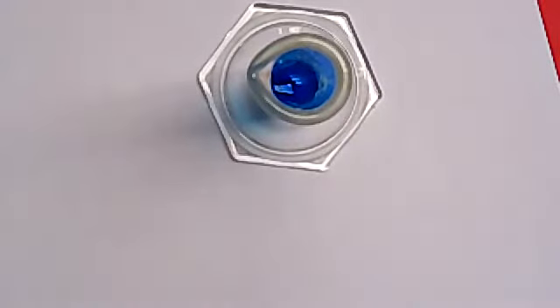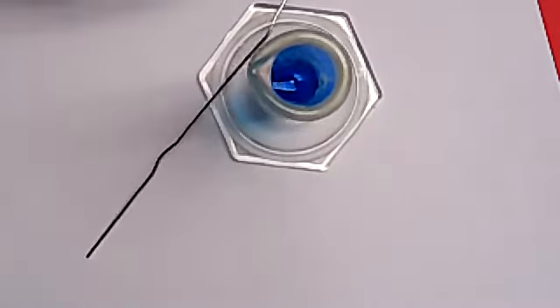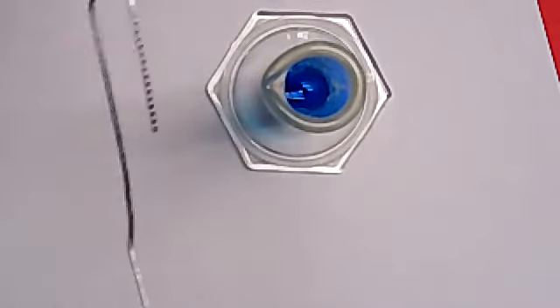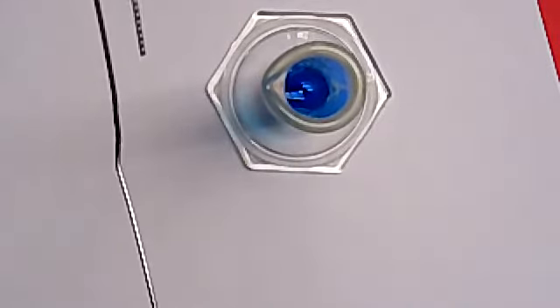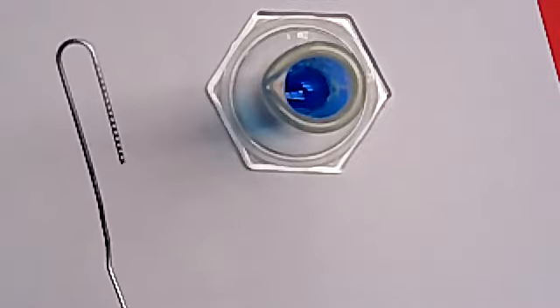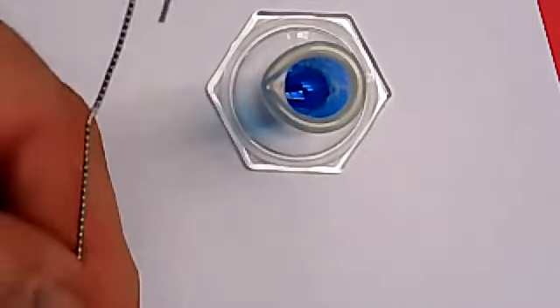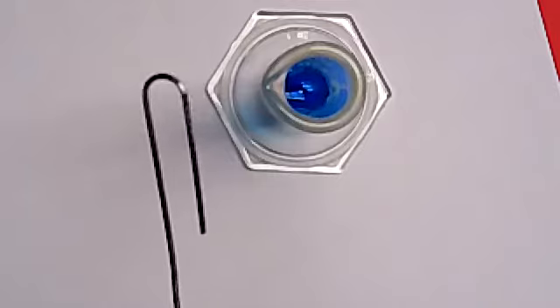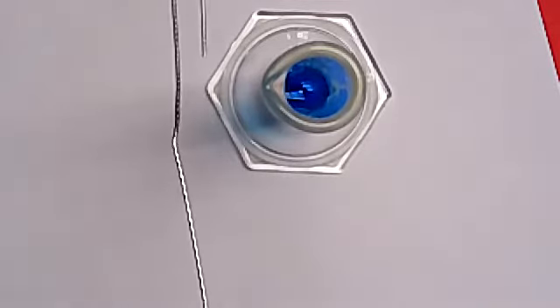All right, our last one. We're going to take a look at a paperclip. There's our paperclip there, and we're going to take a look at adding it into a graduated cylinder, as you can see, of copper sulfate. So before we add it in our data table, in the 0 seconds column, you're going to want to describe this paperclip. Well, obviously it's irregularly shaped. I basically opened it up. It's rather bumpy or rough in certain areas. It's silver, right? It's a solid. Can you think of any others to add to that?